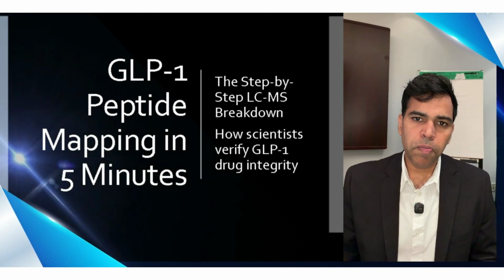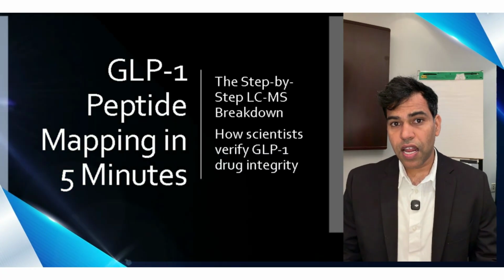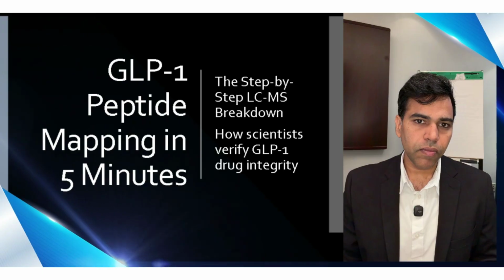How to perform peptide mapping of GLP-1 analogs using LC-MS.